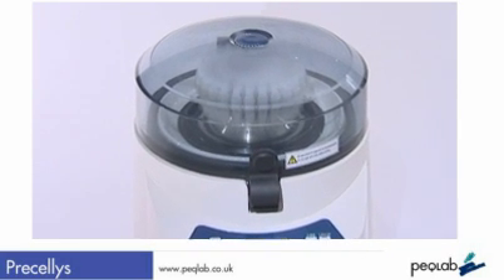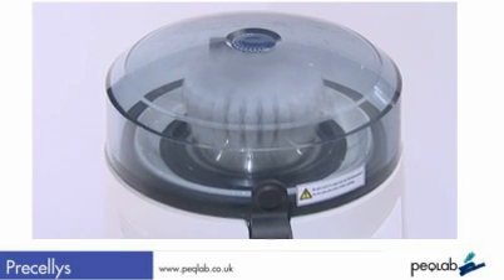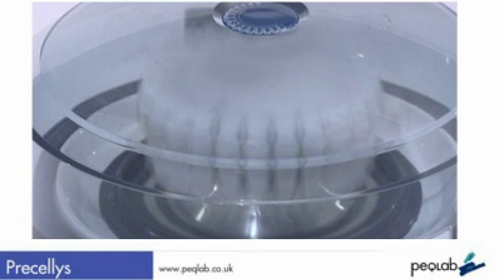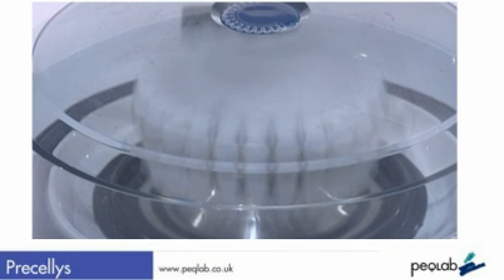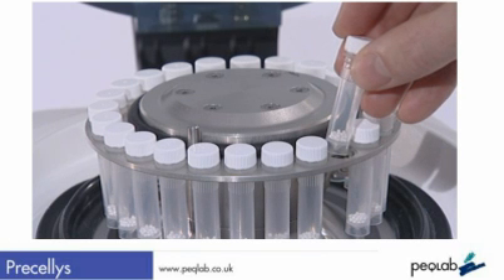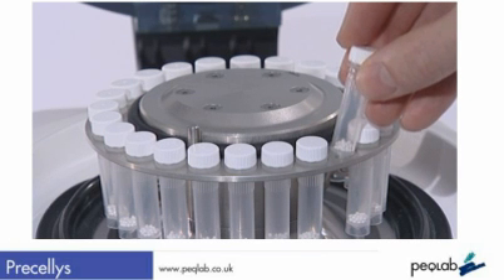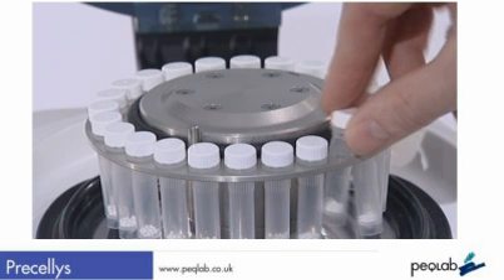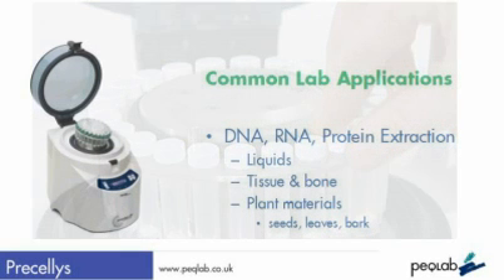Each tube is 2 ml in volume and is pre-filled with steel, ceramic, or glass beads to suit your application. In principle, the bigger steel or ceramic beads are used for tougher materials like seeds or grain, while the glass beads are used for the disruption of microorganisms, bacteria, and fungi. But here at Peclab, we can provide full application support on this matter.